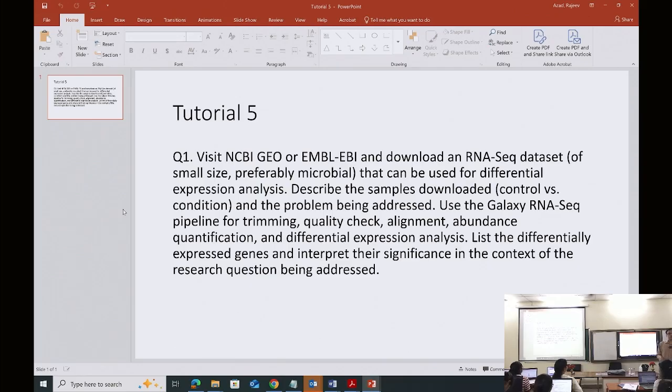Okay, so I would encourage you to try the RNA-Seq pipeline at Galaxy. Try it. I have provided you the screenshots. Why not try it with the accession numbers also that I think Shravani will forward to you all. To begin with, do not use 3 replicates, just use 2 replicates. Try it and see what you are getting.